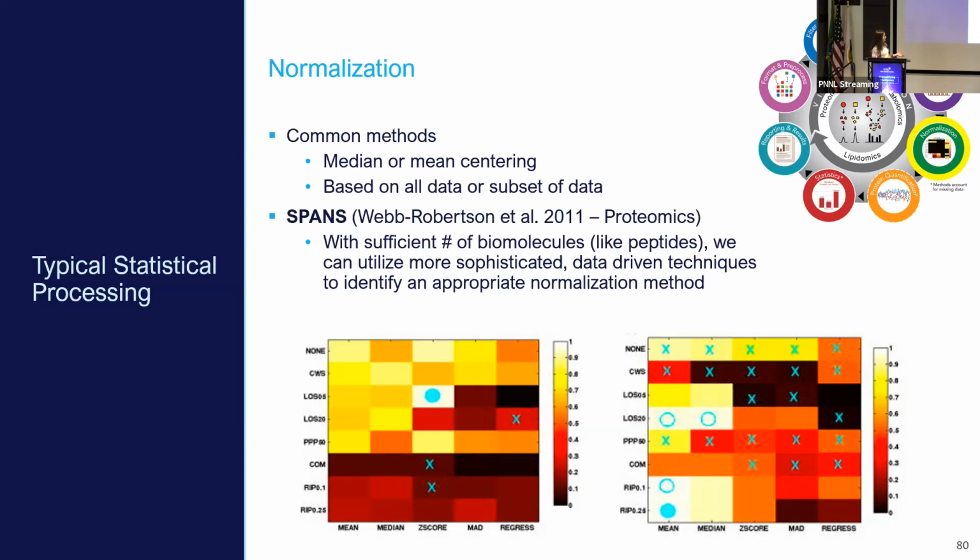What we end up getting, either through PMART-R or through MAP, is a plot like this where the cell with the dot recommends the top choice. That's going to introduce the least bias into your data.